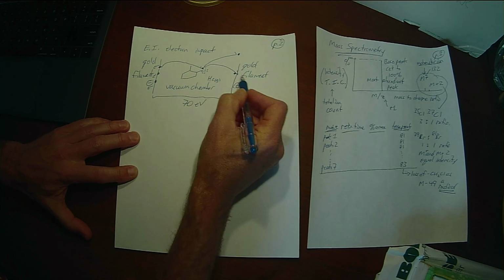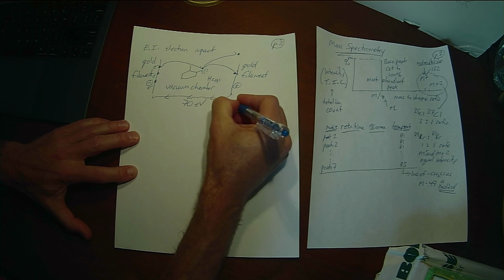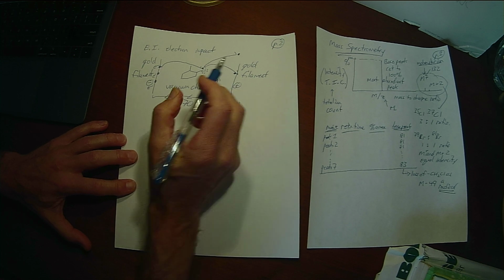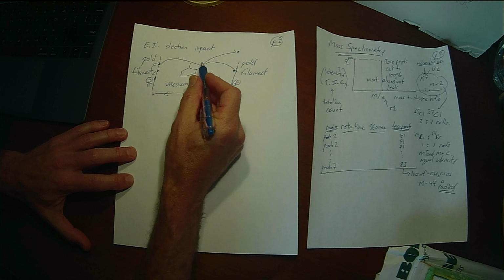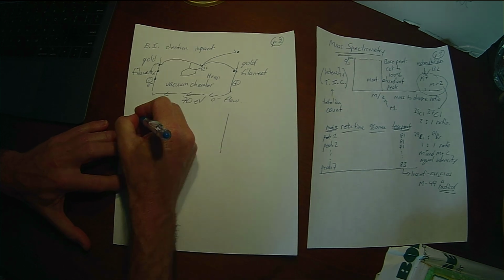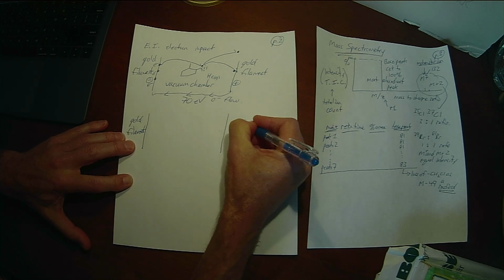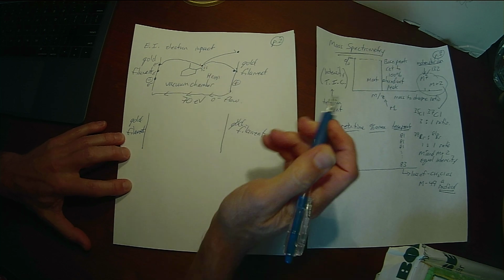And when they collide with this gold filament, we'll see actual charge, right? We'll have the electron flow. And that's what we're seeing with the total ion count. Or, sorry. The total ion count now, we're going to... So we got our gold filaments, and we just bombarded it. If you've ever played marbles, it's very much like marbles, where when the electron hits it, both of them go shooting out.